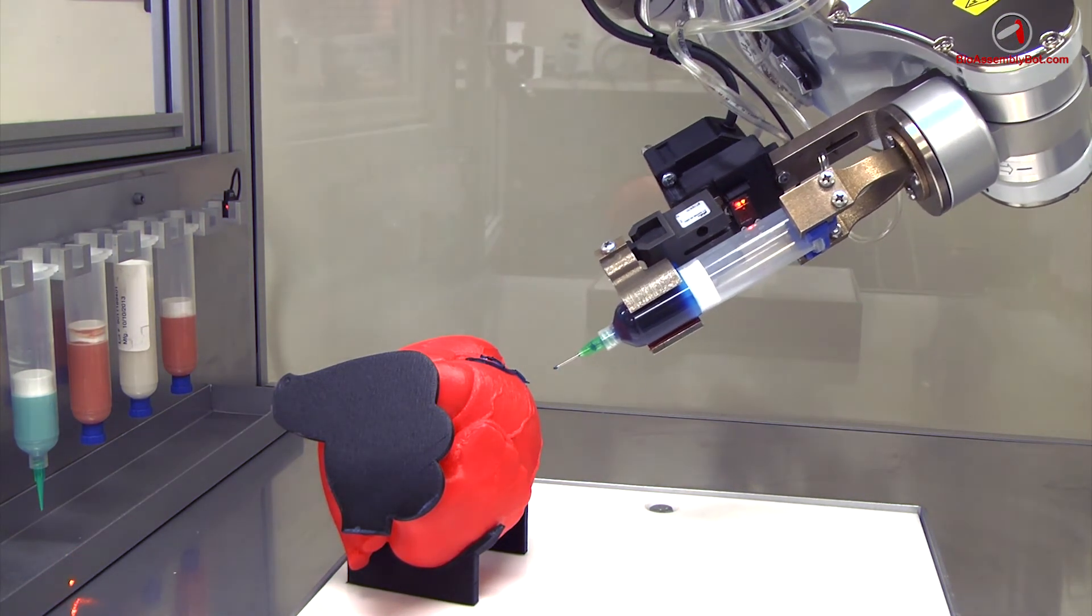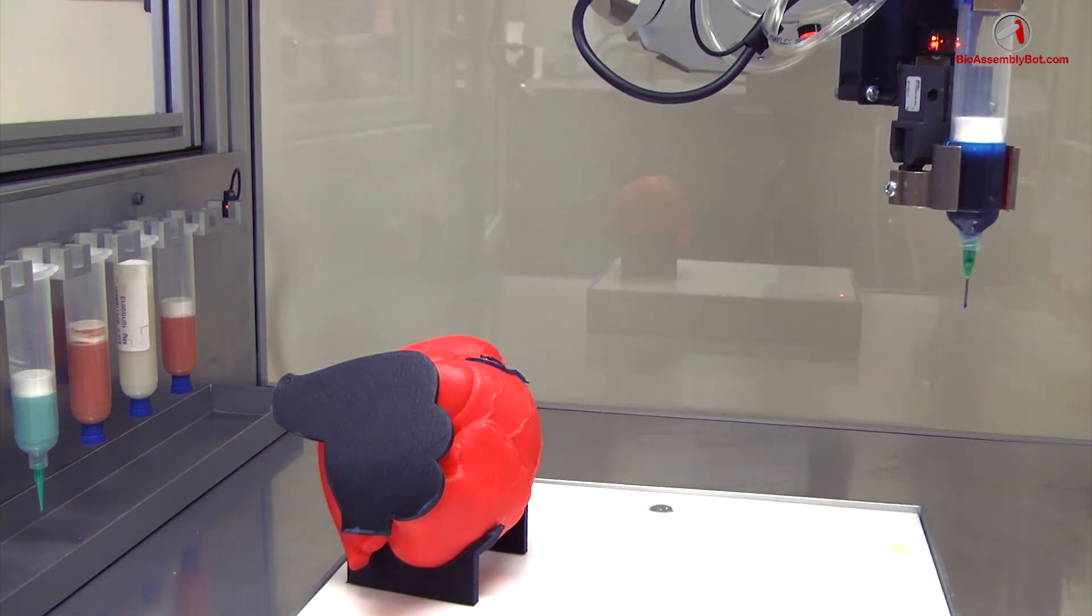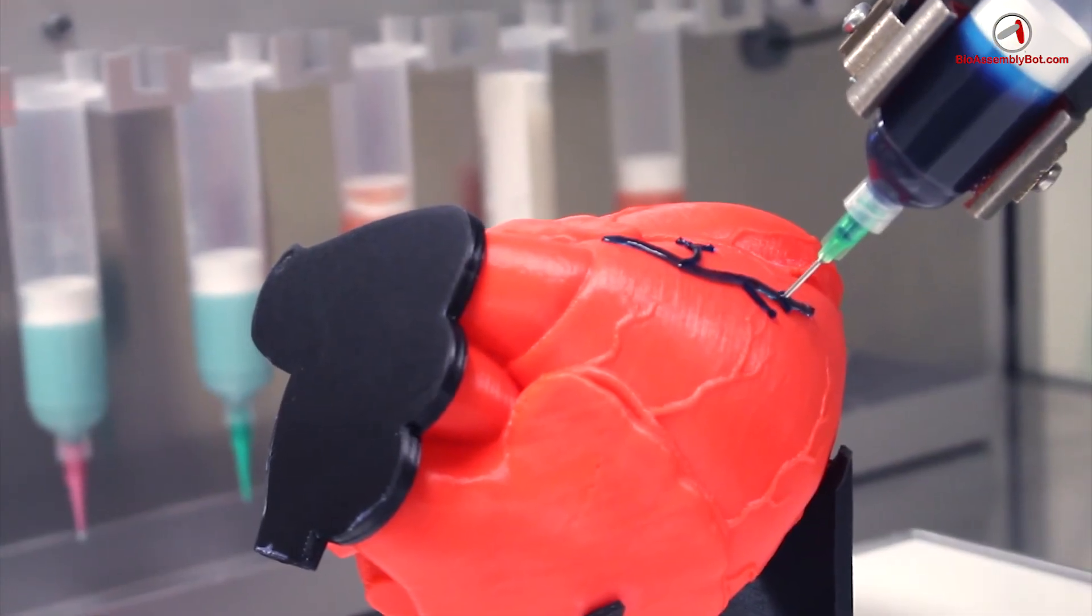Notice the robot here is following contours even all the way down to the lateral side of the heart model.